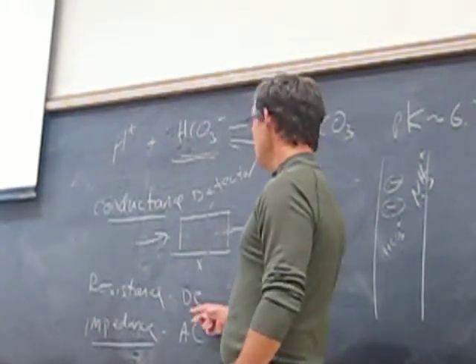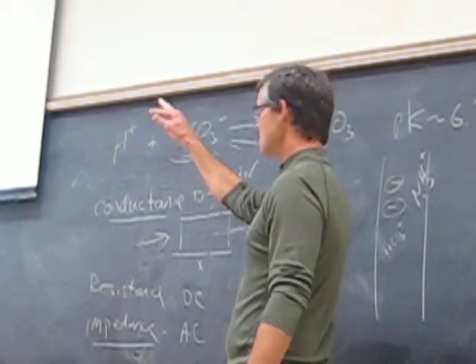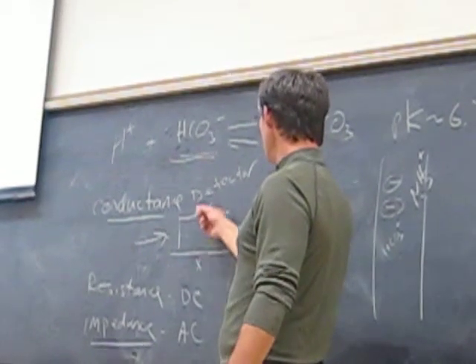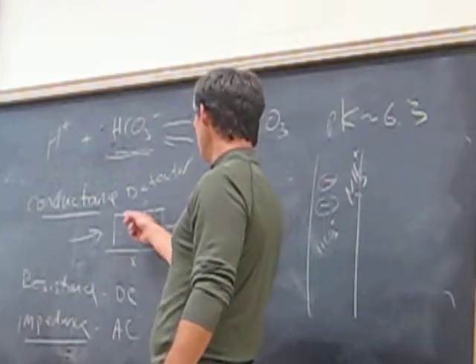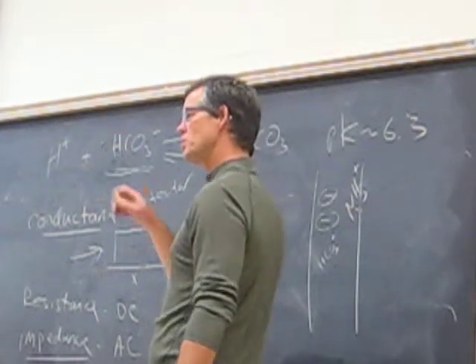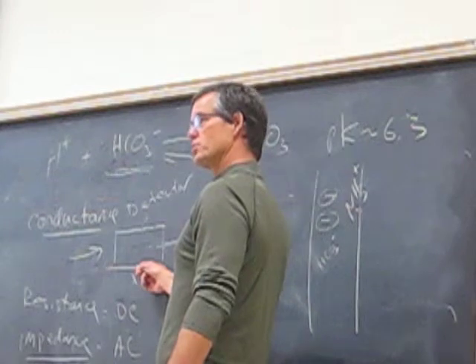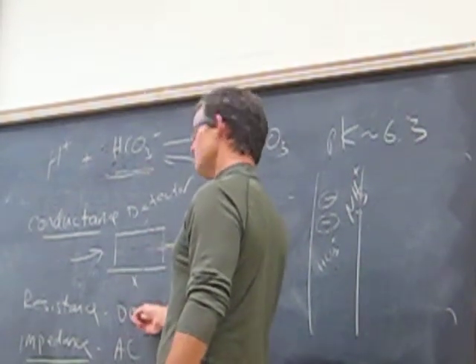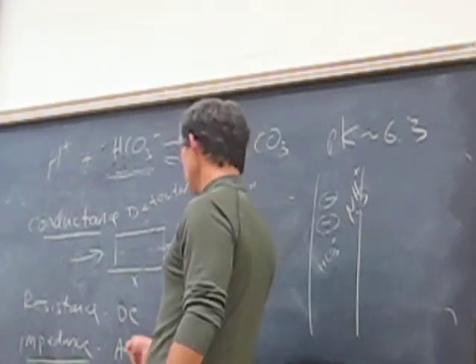And the reason that this doesn't have a transformer to convert the AC to DC is because in conductance detectors that are operated under a DC current circuit, over time there's a polarization of the poles, and there's a drift in the baseline that becomes noisier. So it's not as effective as an electrical circuit controlling conductance detectors if they're direct current circuits compared to alternating current circuits.